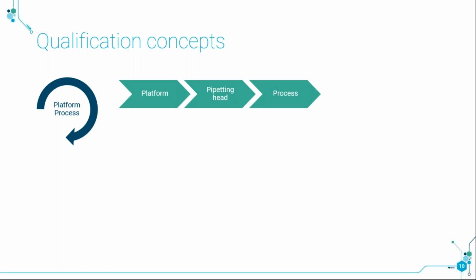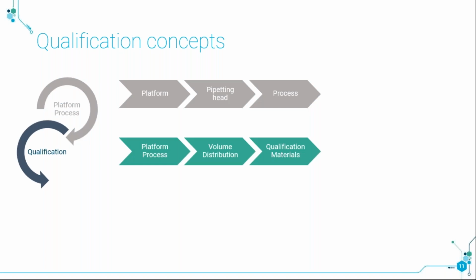Once you name it, you will add information to it to create a second level of information called qualification. In the application, the qualification is actually the experiment that you run on your bench. What you're going to do is really to take everything that you're doing on the bench and transpose it into the application.